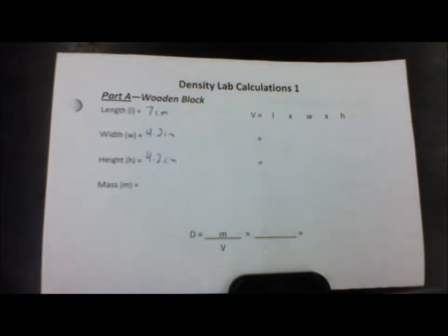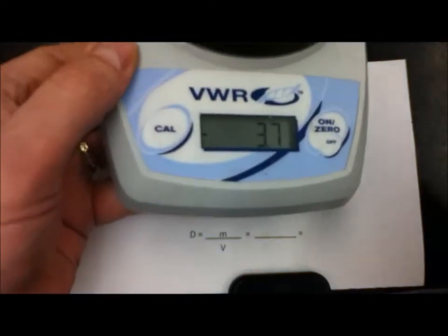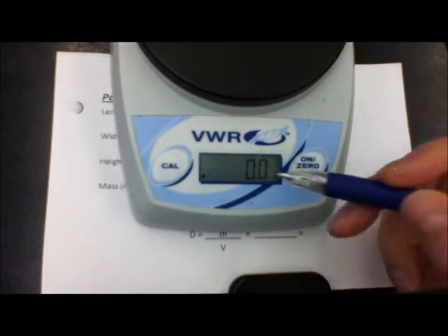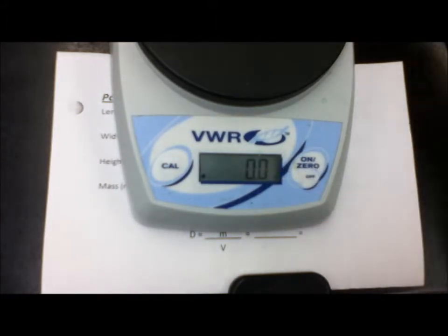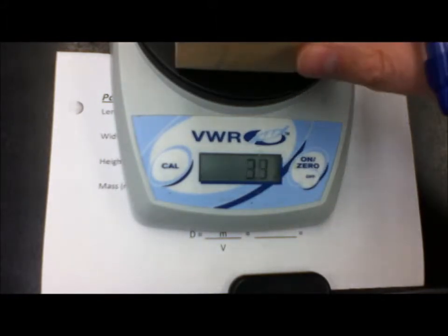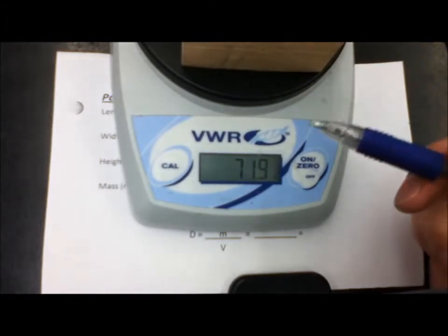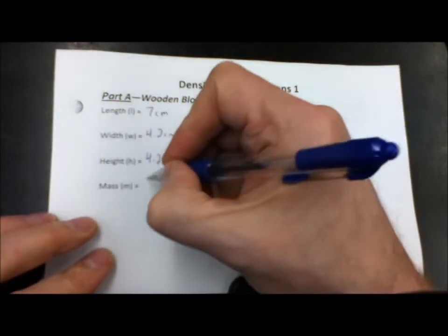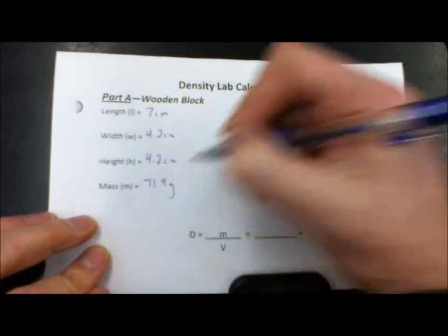So we're going to just put that to the side for a moment and bring in our scale. Our scale is set to zero, so we want to measure the mass of our wooden block. And we notice that it is 71.9 grams. So we want to write that information here, 71.9 grams.